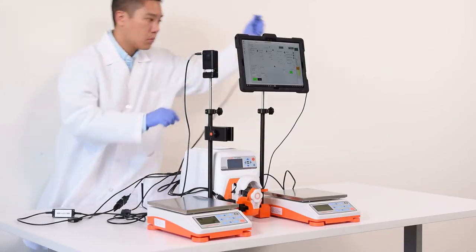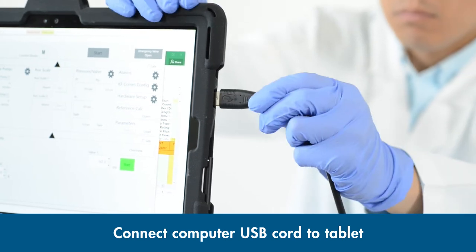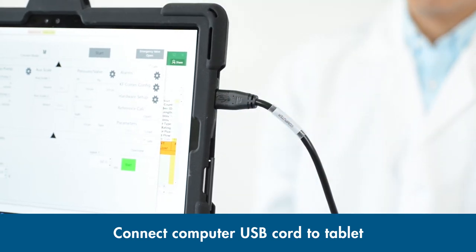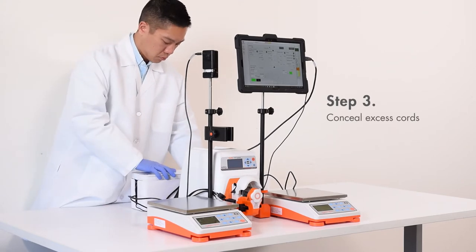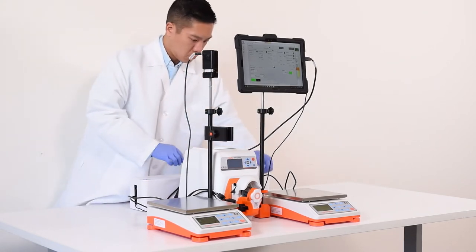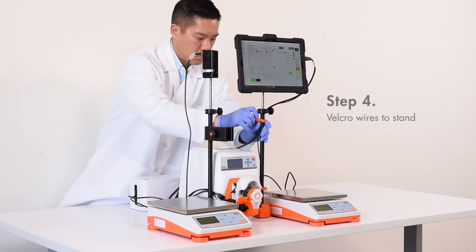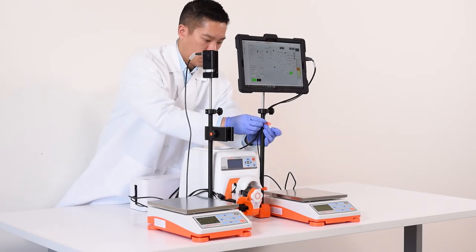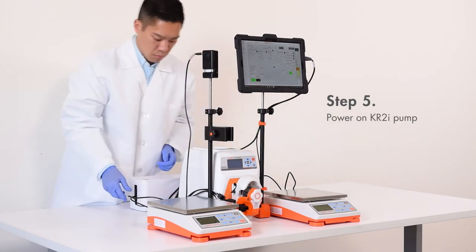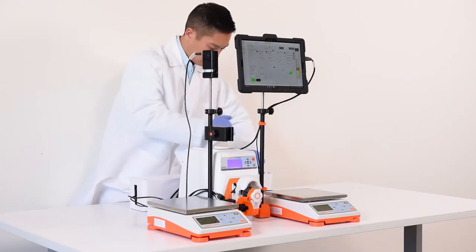The last connection before running the system is between the USB computer cable to the Surface tablet. Conceal excess wiring to the cable management boxes and Velcro the loose wires to the stands. Power on the KrosFlo KR2i TFF system by flipping the power switch on the back of the pump.